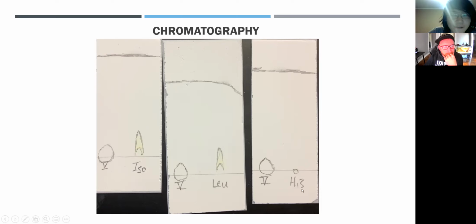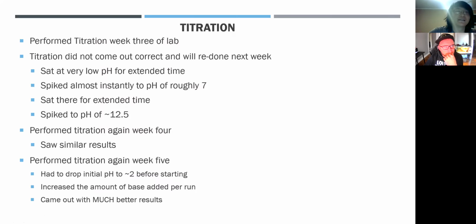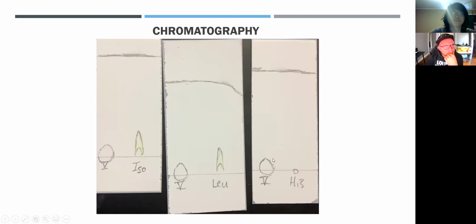And if you look at the histidine one, the tagged unknown number 5 and the tagged histidine both stuck at the starting position. So this gave us a reason to believe that histidine is the one on the N terminus, since the tagged histidine matches the Rf value of the tagged unknown number 5, with only the N terminus amino acid being tagged.